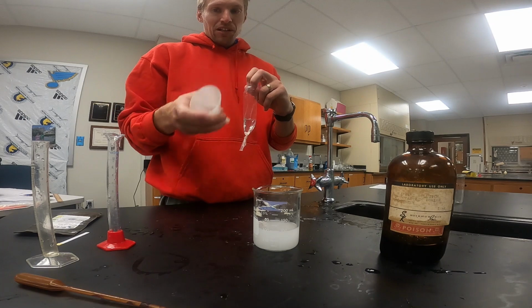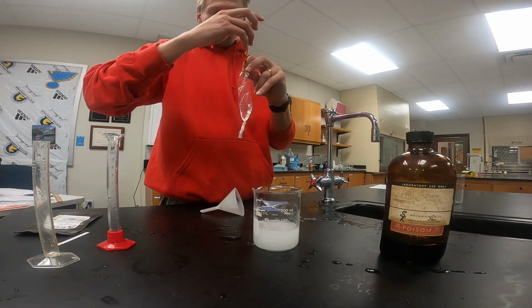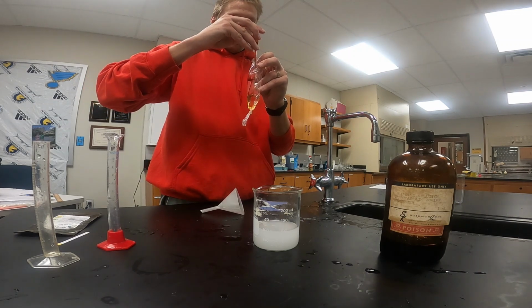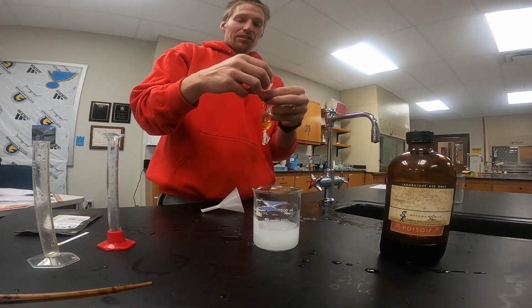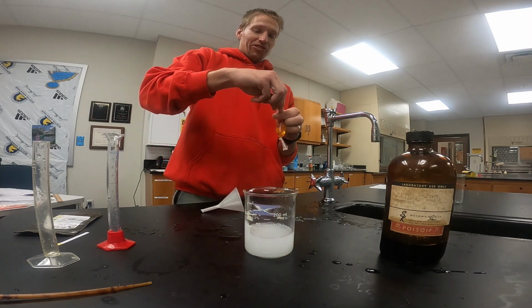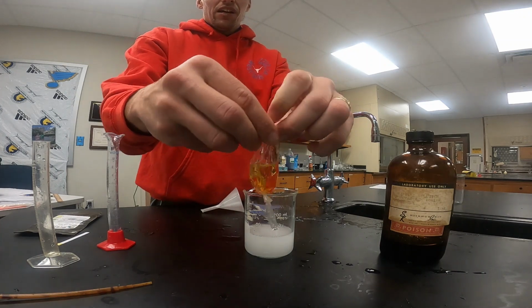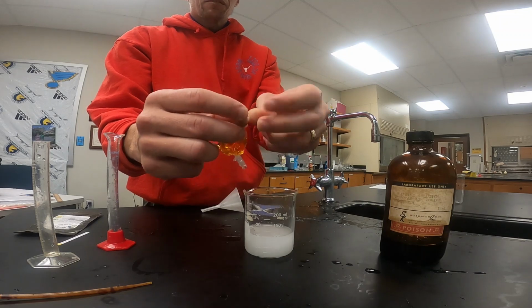I'm going to keep the bag open as I add a few drops of iodine inside the bag as well. So to my water, I'm just adding a few drops of iodine. I want to make sure we get it down into that water. Now we should be able to record the appearance of inside the bag and inside our beaker. Our beaker has a nice cloudy white appearance to it, and our bag has this golden color. I'll tie it off, rinse it off, and then we'll put it in our beaker again for 20 minutes.